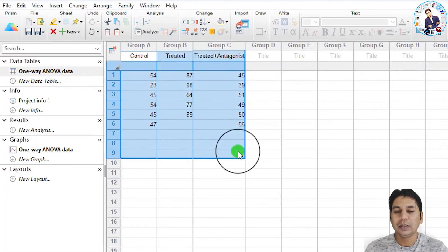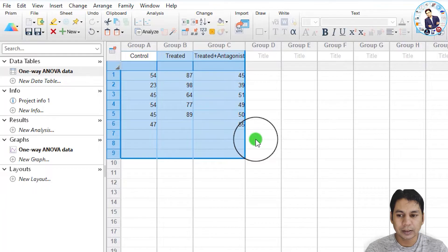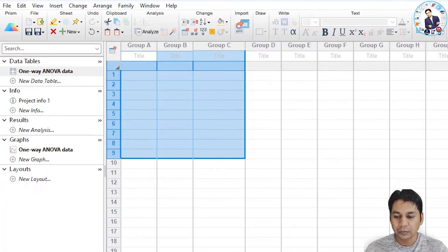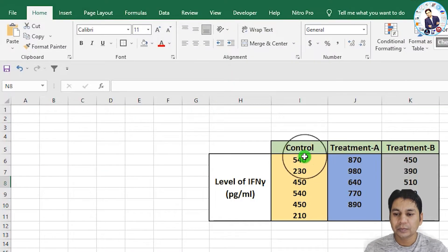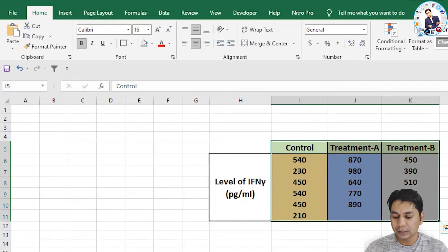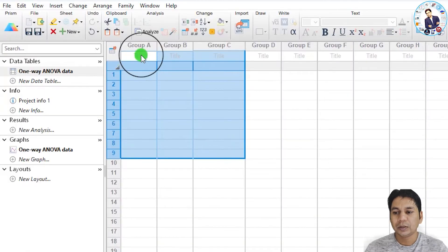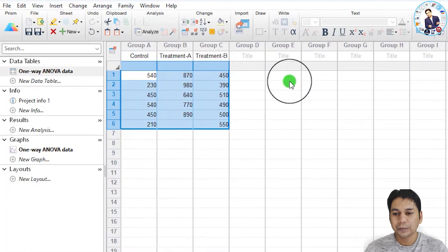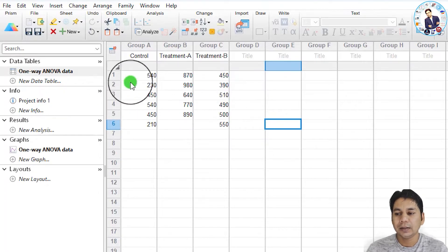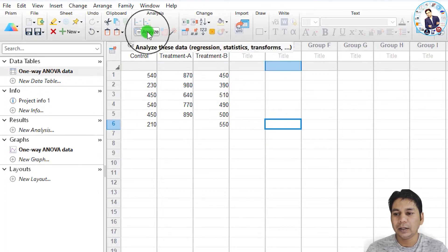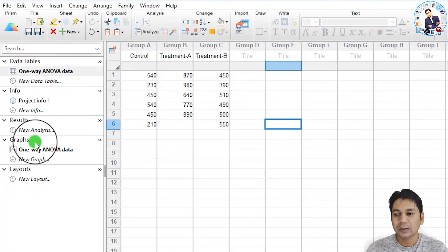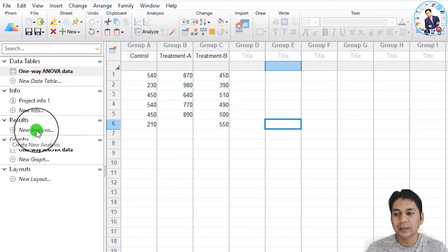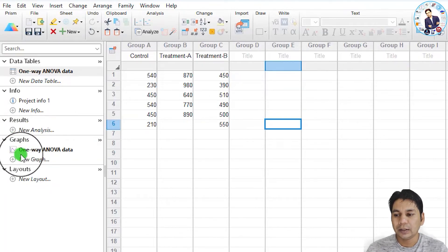You can see sample data already present for tutorial purposes in GraphPad Prism. You can select and delete this data, then copy your own data from an Excel sheet and paste it into GraphPad Prism. To analyze the data, click the 'Analyze' button, or use the 'New Analysis' option in the results section.